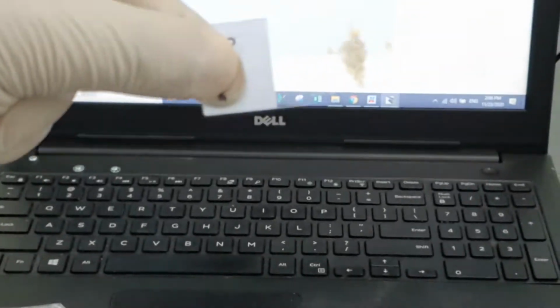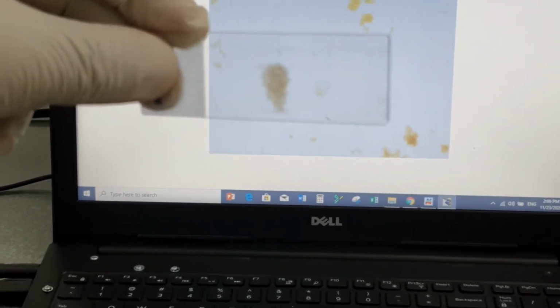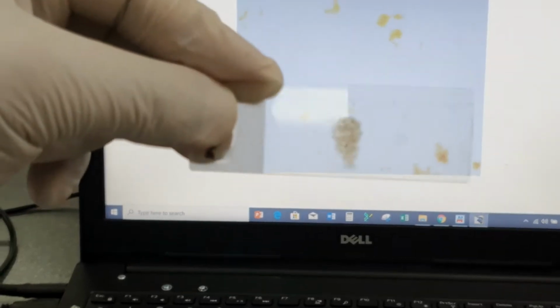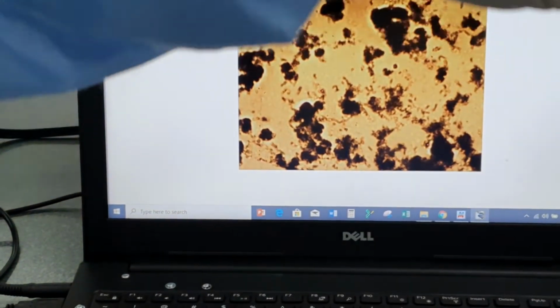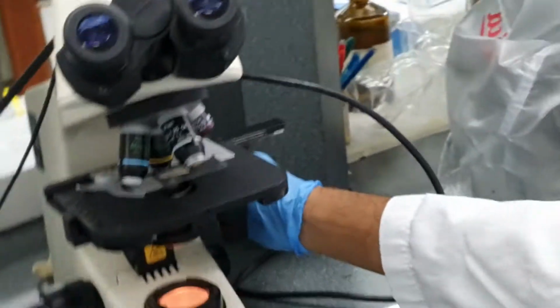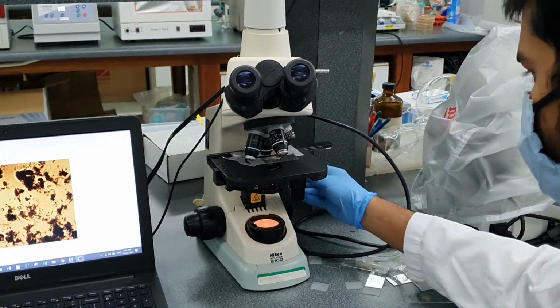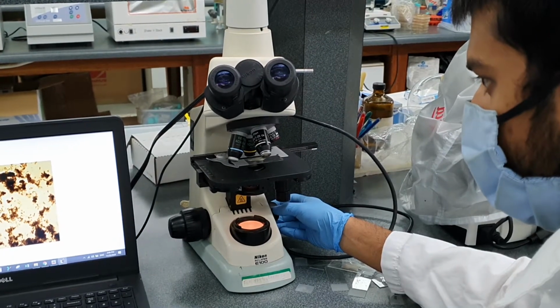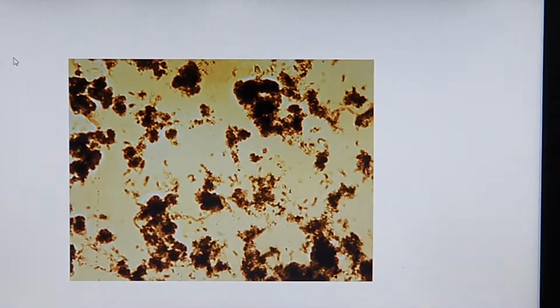To prepare the microscopic slide, we put a small sample of the fungal mycelia from the petri dish onto a slide, right? There's no need to stain these fungal mycelia because through the light microscope, these are more or less transparent, and light is able to pass through them without the need for a stain, right?